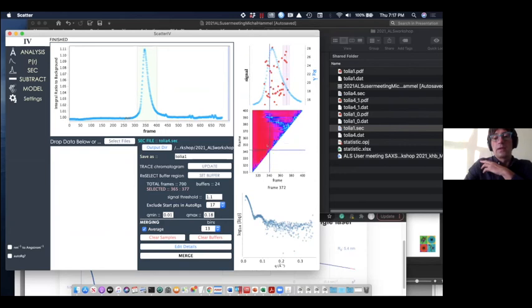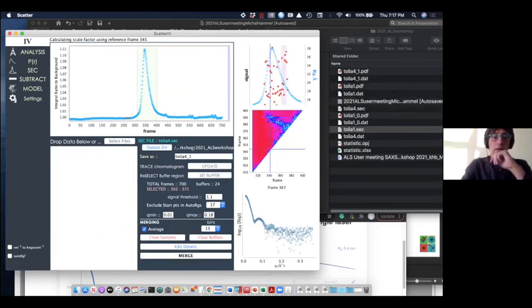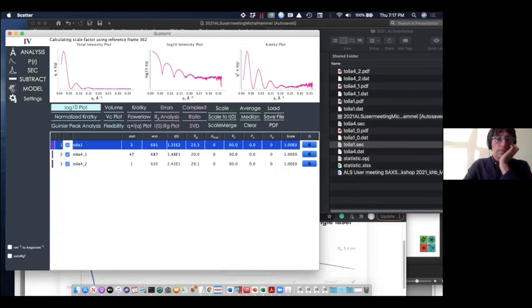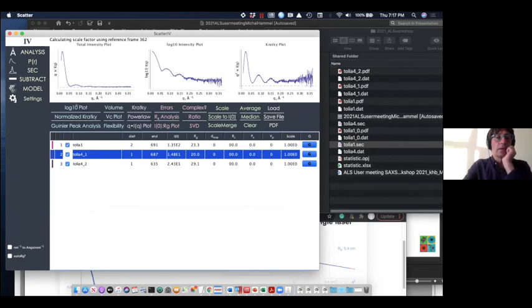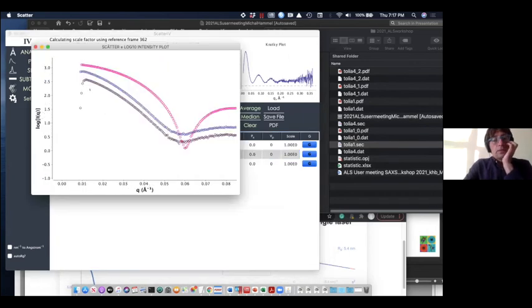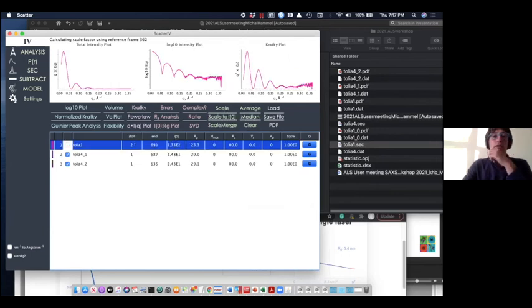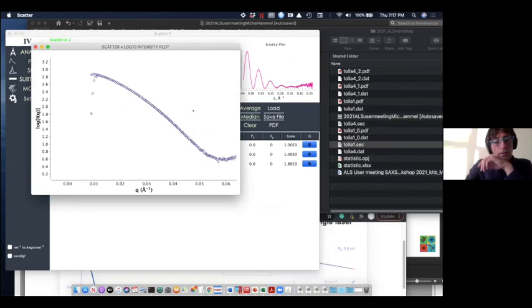And you can also select this region and say, this is my curve 1, and you merge that. And you can also compare with this region and call it curve 2. What you do here, and indeed, when you compare the black one versus the blue one, they are a different size. You can see it from the RG. Not really. So they are the same.